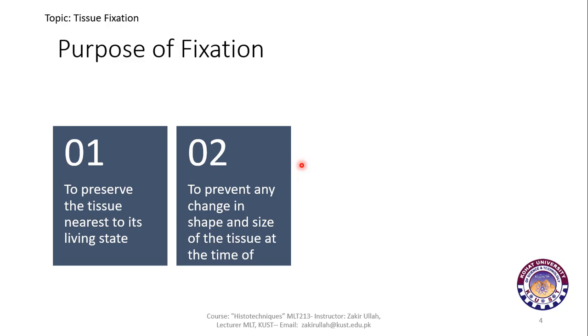either morphological change, a change in the shape or the size, or any sort of change in the cells. So, to stop any kind of change in the cells in the tissue, the fixation process is performed.